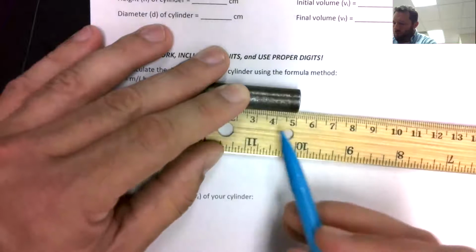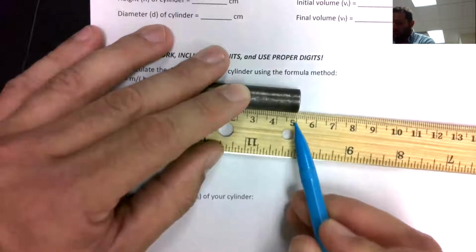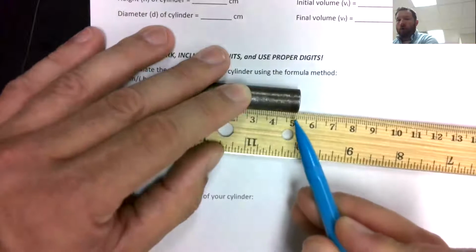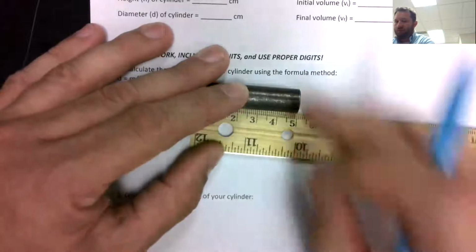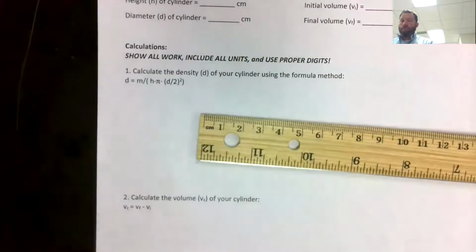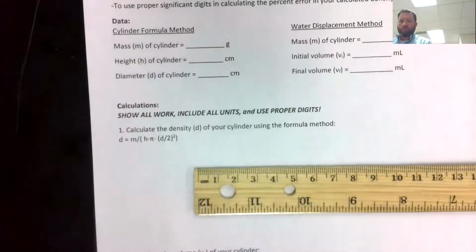Remember, we know for a fact it's past 4.9. I don't think it's quite to 5, so we know for a fact it's at least 4.9. You need to know how many digits to record. We know it's 4.9. How many do you write? And again, this measurement is in centimeters. How many do you record? And that value goes right there. That's the height of your cylinder.